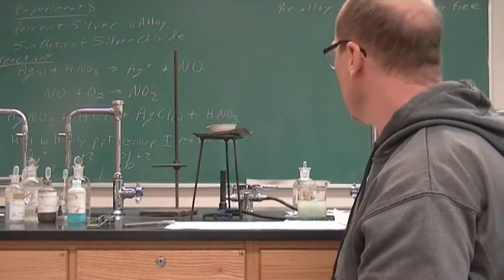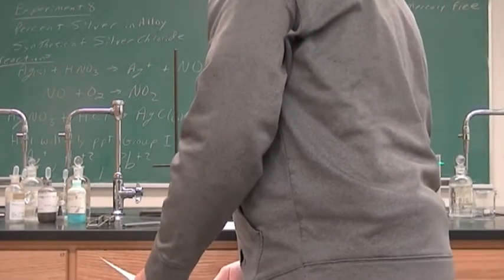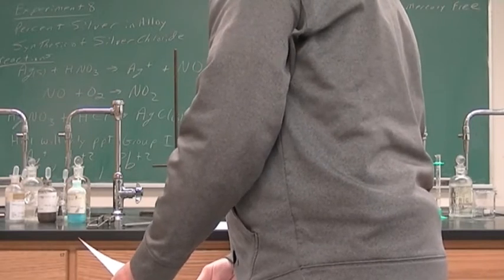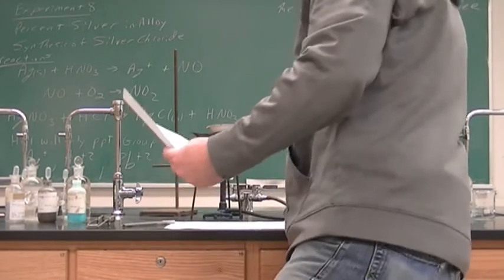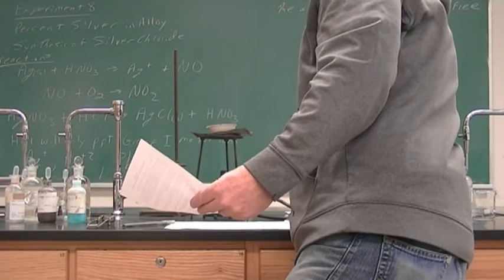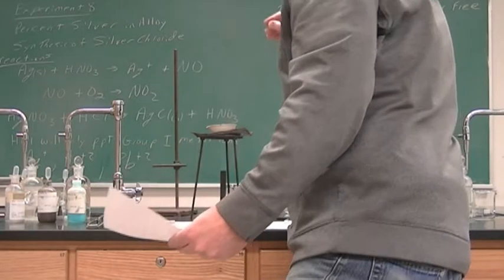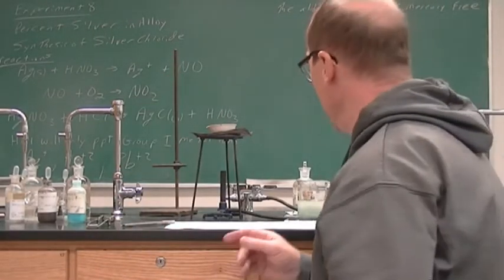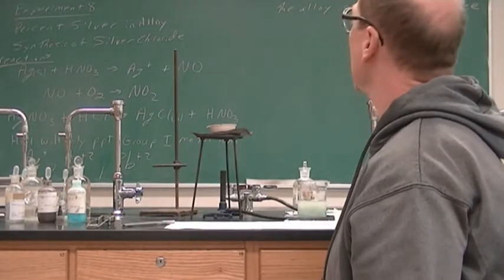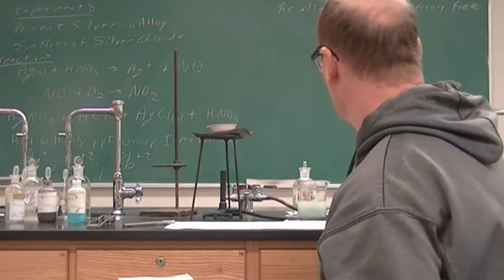And hopefully we don't see anything shooting out the top. I want it boiling. I don't want it spraying all over the place. Turn it down a little bit. Well, since I wasn't worried about losing the silver, it would have been a better idea to decant some of the water that I poured in there before heating it. It's just going to take longer to boil out all that water instead of just pouring it out.